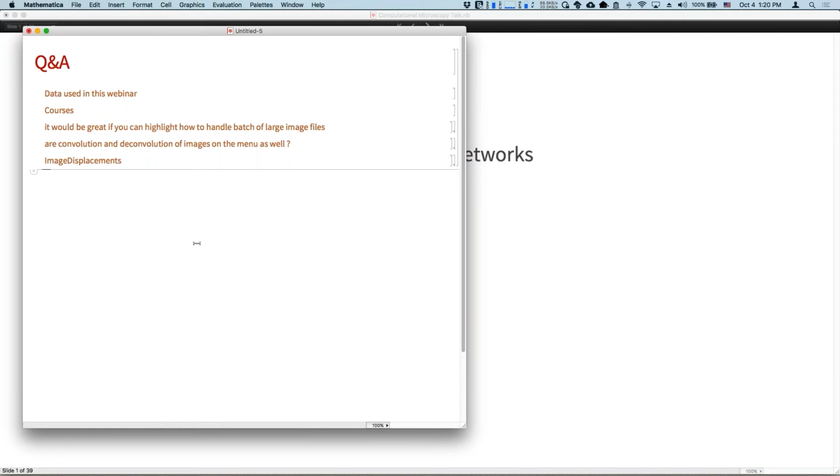Note that the image processing capabilities of Mathematica have been there since version 7 and are fairly well developed. Everything neural network is fairly new, and actually both sides of it, both image processing and neural networks, are still under very active development. But I think the neural networks part is under even more active development. It is still not a very mature subframework. Everything is evolving in the field of neural networks, not even talking about Mathematica. So look forward to more advancements, more features, and more automation in that domain as well.